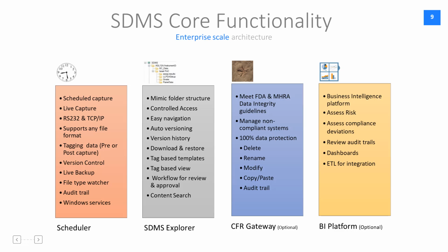And if you notice, SDMS Explorer mimics the folder structure of the original instrument software's folder structure. This is one of the core features of LogiLab SDMS. You don't have to change the folder structure for storing inside the LogiLab SDMS. The LogiLab SDMS will mimic the original folder structure.